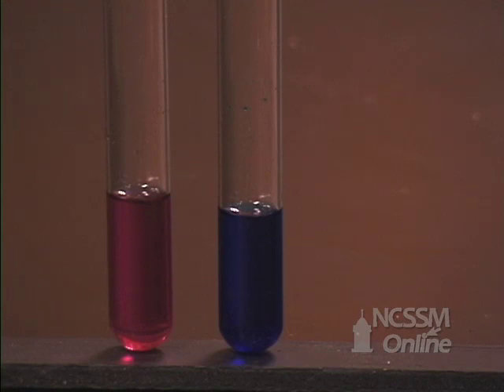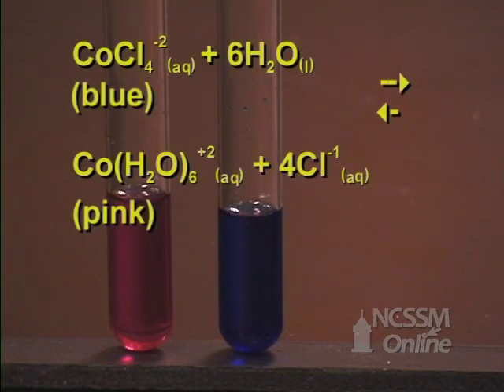We will now look at the equilibrium between a cobalt water complex ion, which is pink, and a cobalt chloride complex ion, which is blue.